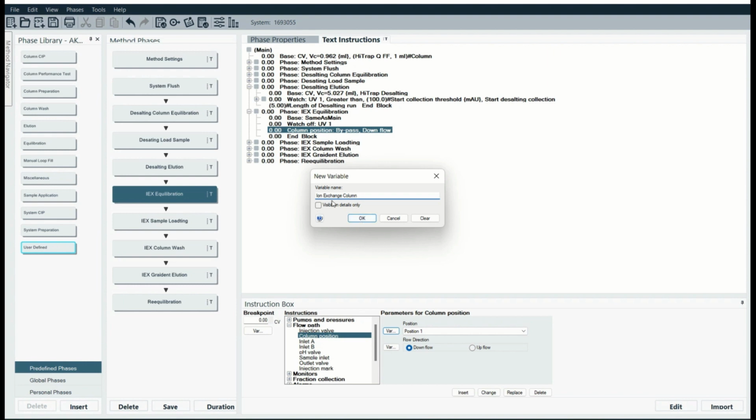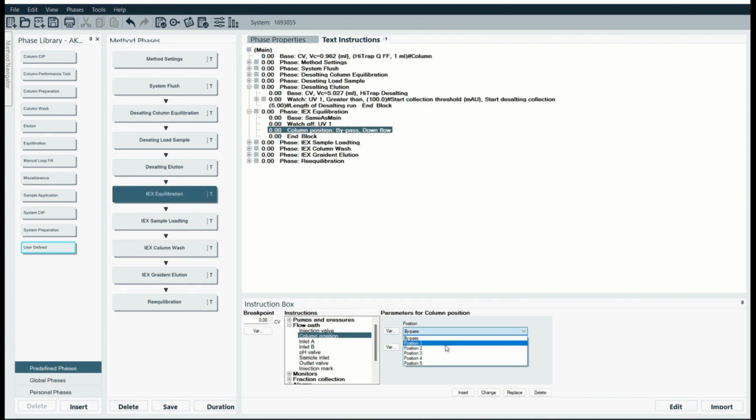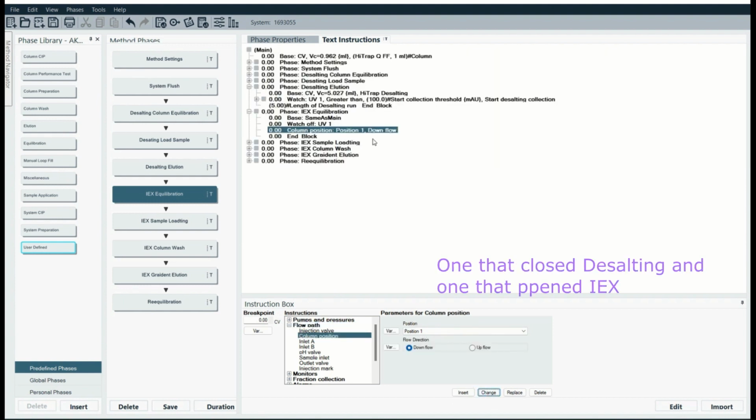Okay. And so this is the column that we're going to mention as we do each of the scouting runs. It's going to be important since we're going to have to change both the column position, right, and the column name right here. We need to make sure we get both of those done. So column position 1, change. Remember, I thought I was going to do 2 column positions, one where I just closed it, another where I opened it, and I just decided that would be silly.